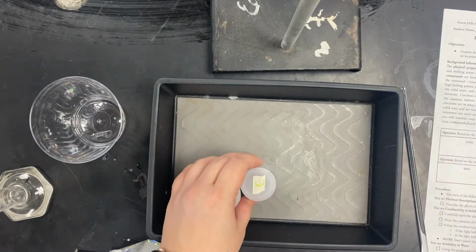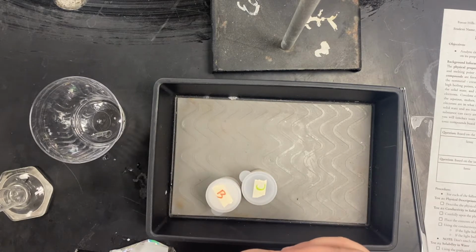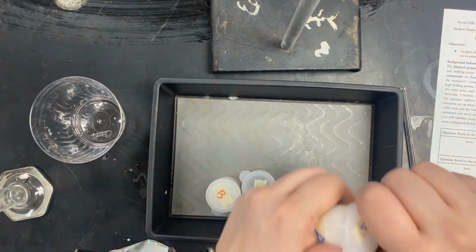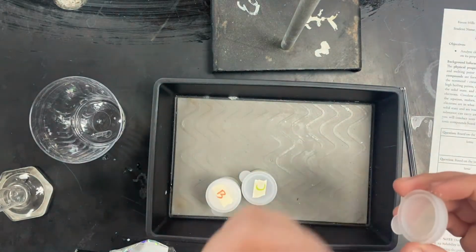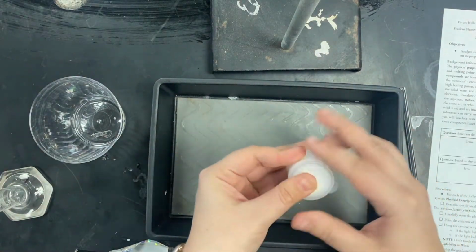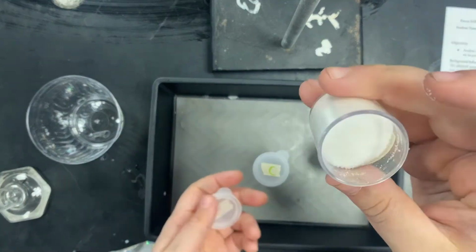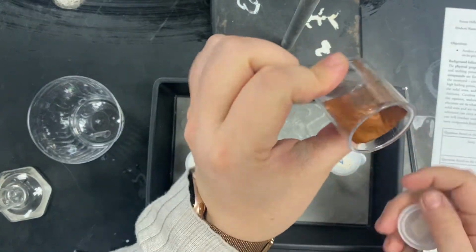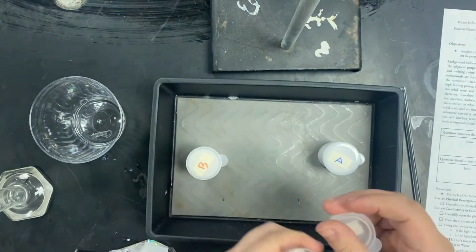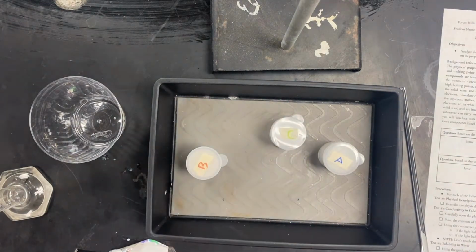Our first test is to look at the physical properties of the substances that you have. So you can open up each sample, touch it, look at it, get a good look at it, close it up. You'll do that for all of your samples, and then see. Your next test, test number 2, is conductivity in the solid state.